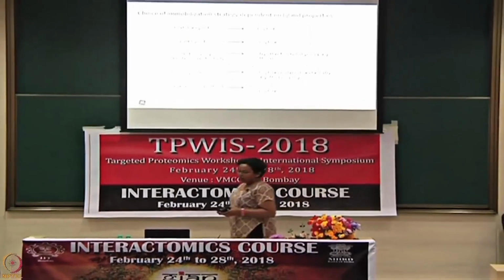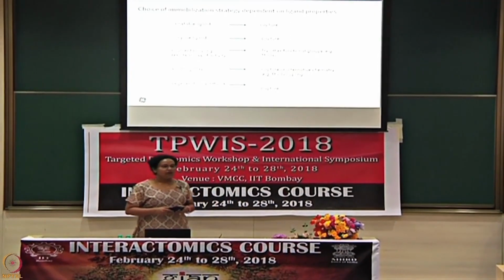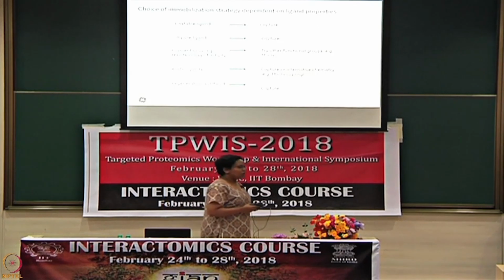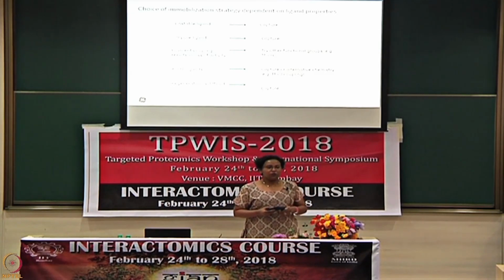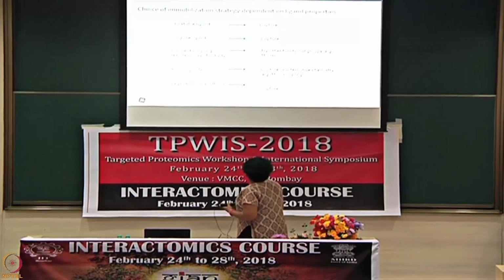Okay. The choice of immobilization strategy will depend on your ligand. Again, amine coupling is very widely used. In more than 90% of cases we typically use amine coupling, particularly with proteins, because there is a huge amount of amine groups available in most proteins.